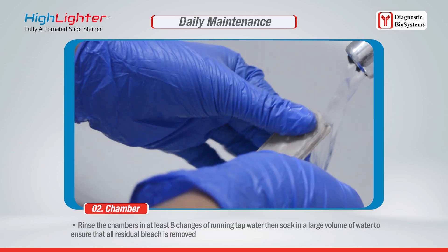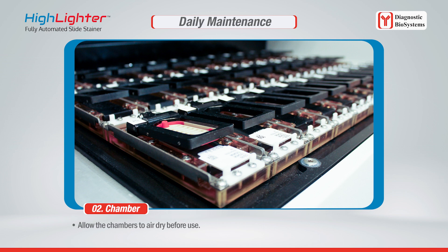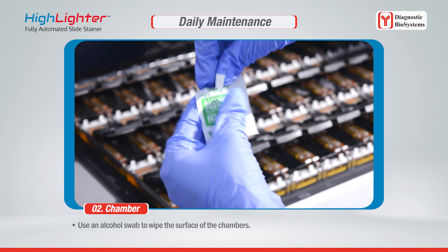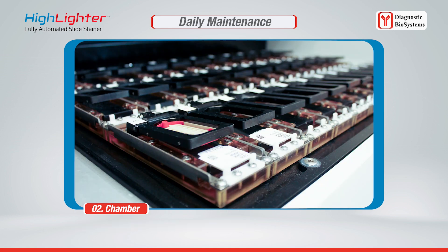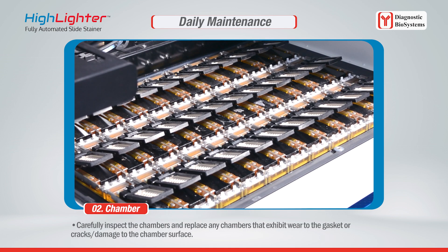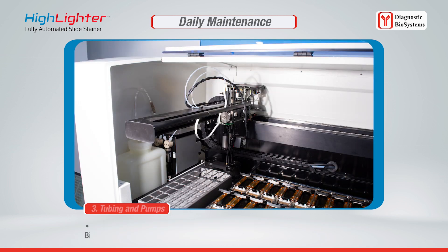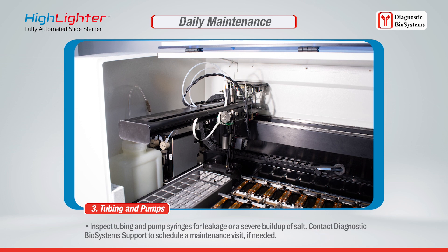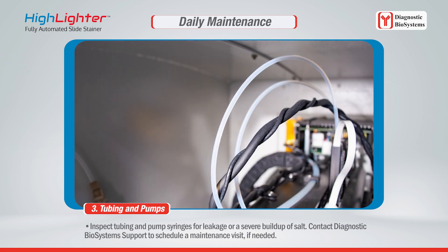Wipe the chamber surface if necessary to remove any remaining DAB residues. Rinse the chambers in at least eight changes of running tap water, then soak in a large volume of water to ensure all residual bleach is removed. Allow the chambers to air dry before use. Use an alcohol swab to wipe the chamber surface and carefully inspect the chambers, replacing any that exhibit wear to the gasket or cracks. Inspect tubing and pump syringes for leakage or severe buildup of salt.